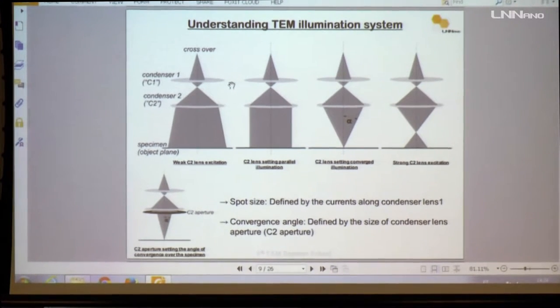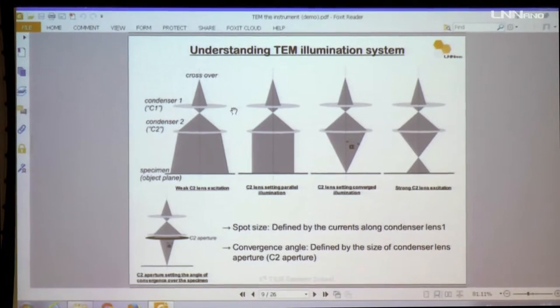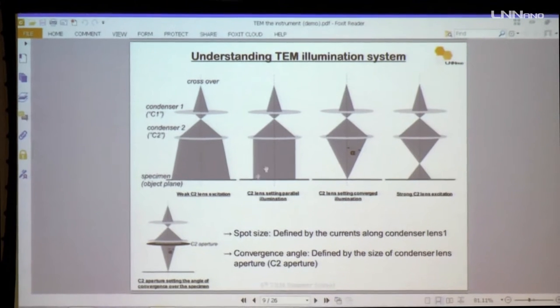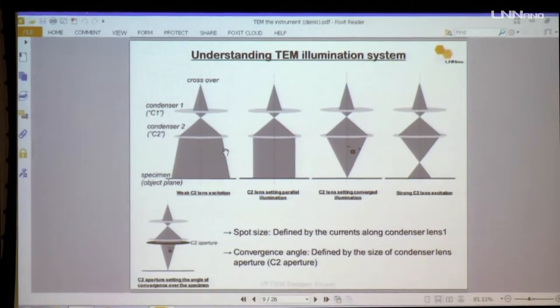Mainly with alpha 3, we get a very parallel beam, not really parallel, something like this. But when you're in alpha 1, it's something like this. It's not really as parallel. It's very parallel here, and not really as parallel here. So it's a kind of like this.